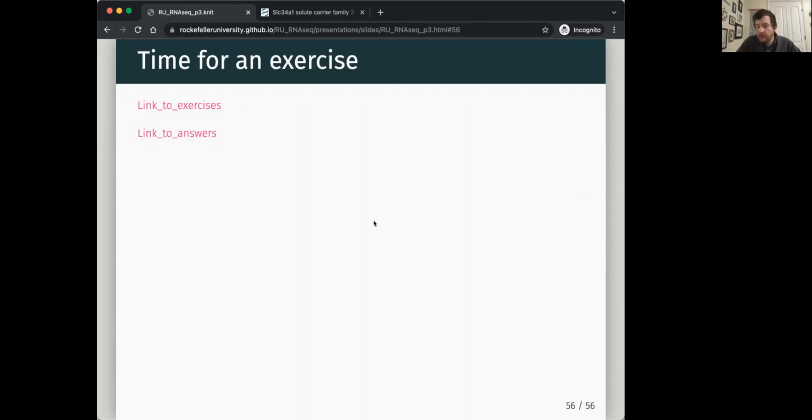I've really big time overrun. I don't expect anyone to finish the exercises in this time.